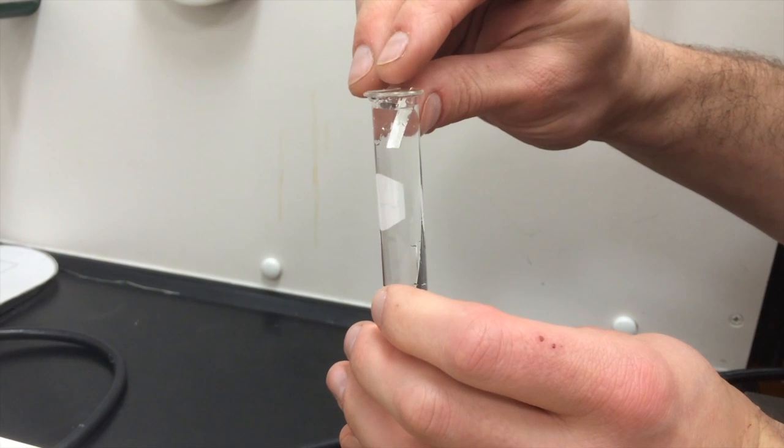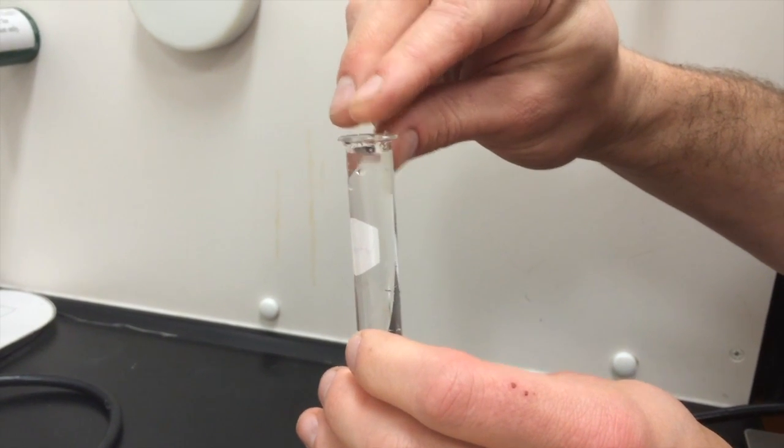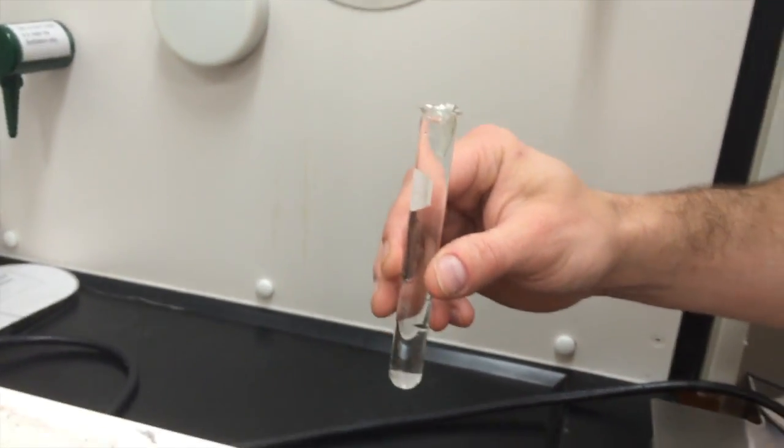We'll now look at the bubbles produced from a metal and acid reaction. For this, bend the magnesium strip so that a small lip forms in the metal, and hang it from the inside of the test tube like so.